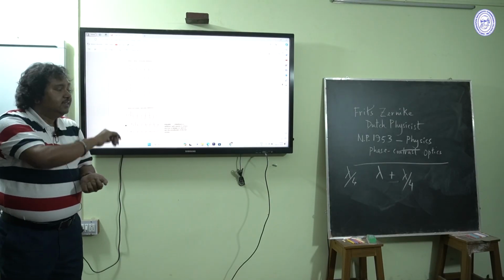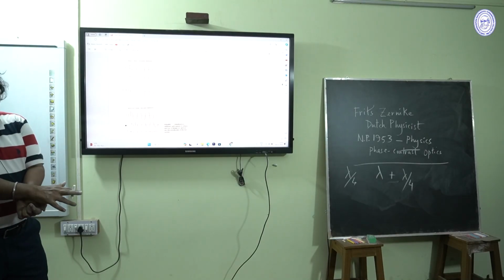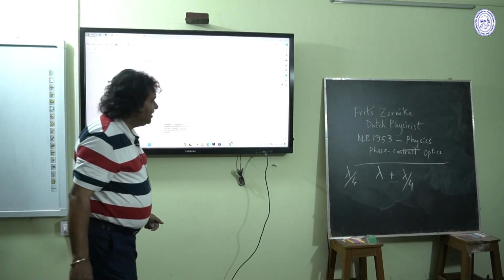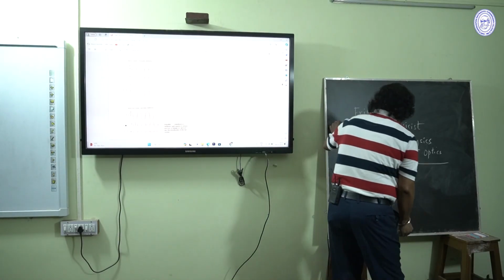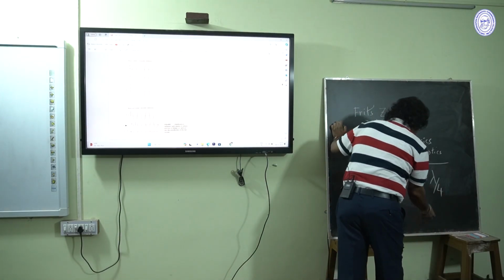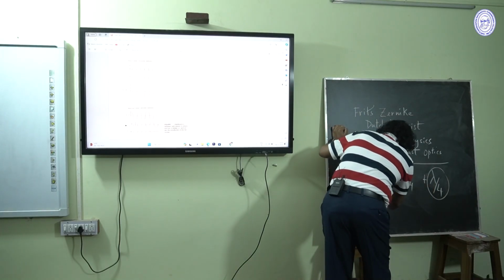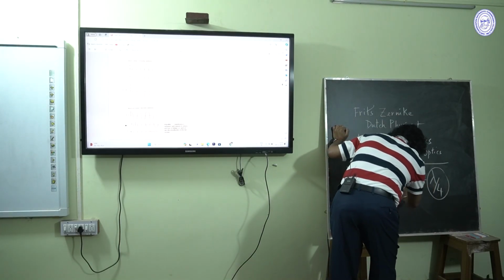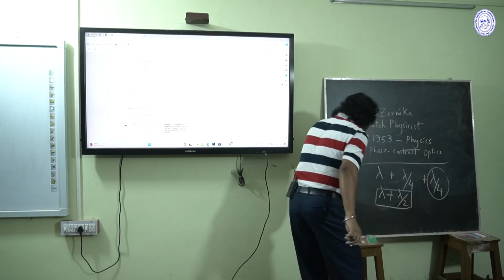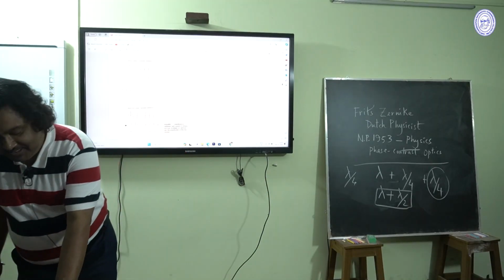What Zernike did, he developed a device that adds an extra phase change of lambda by 4. So the final phase change will be lambda by 2. That is perceptible to our eyes.